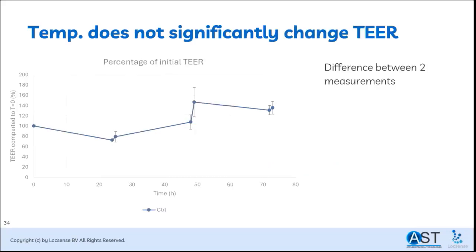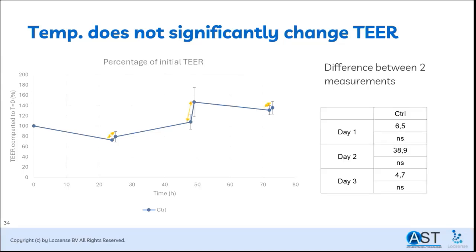Let's first have a closer look at the healthy control. You see measurements at different time points: zero, 24 and 25 hours, 48 and 49 hours, and 72 and 73 hours. Remarkably, there are some differences between the time points before and after EGTA addition, which is unexpected since EGTA is not added to the control. What did happen was that the well plate was taken out of the incubator and put back repeatedly — all this handling can change the temperature of the medium and the cells, and temperature has a great influence on the measured impedance. Even though these changes might seem impressive in the graphs, they are not significant. We can state that temperature does not significantly change the TEER results.